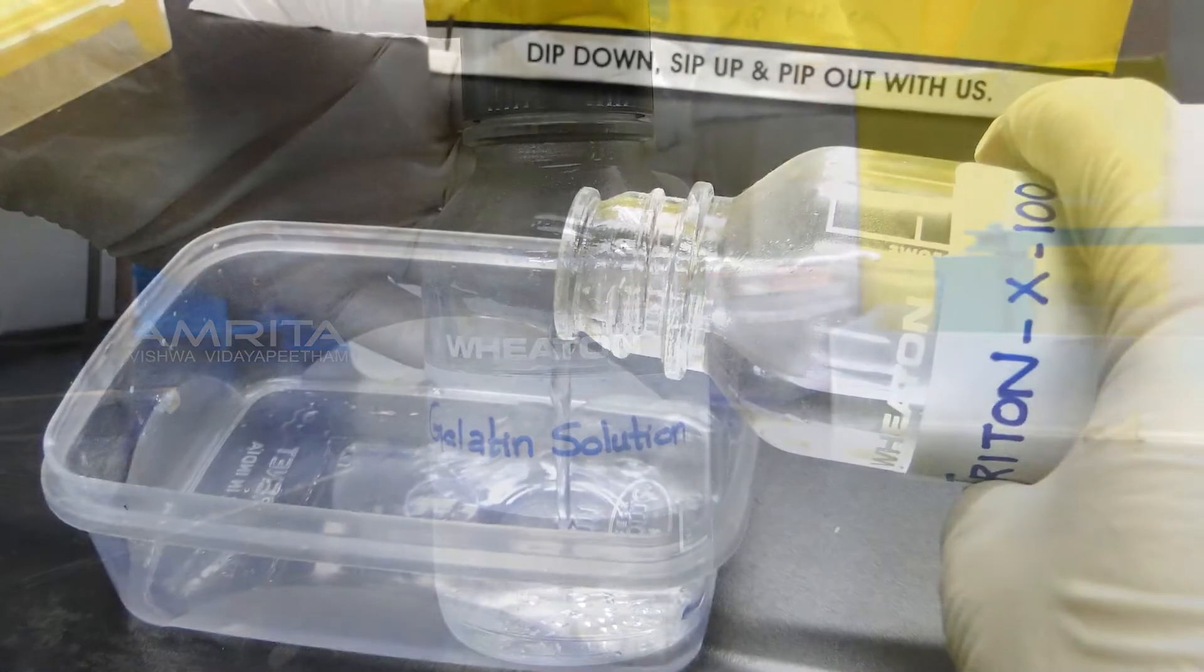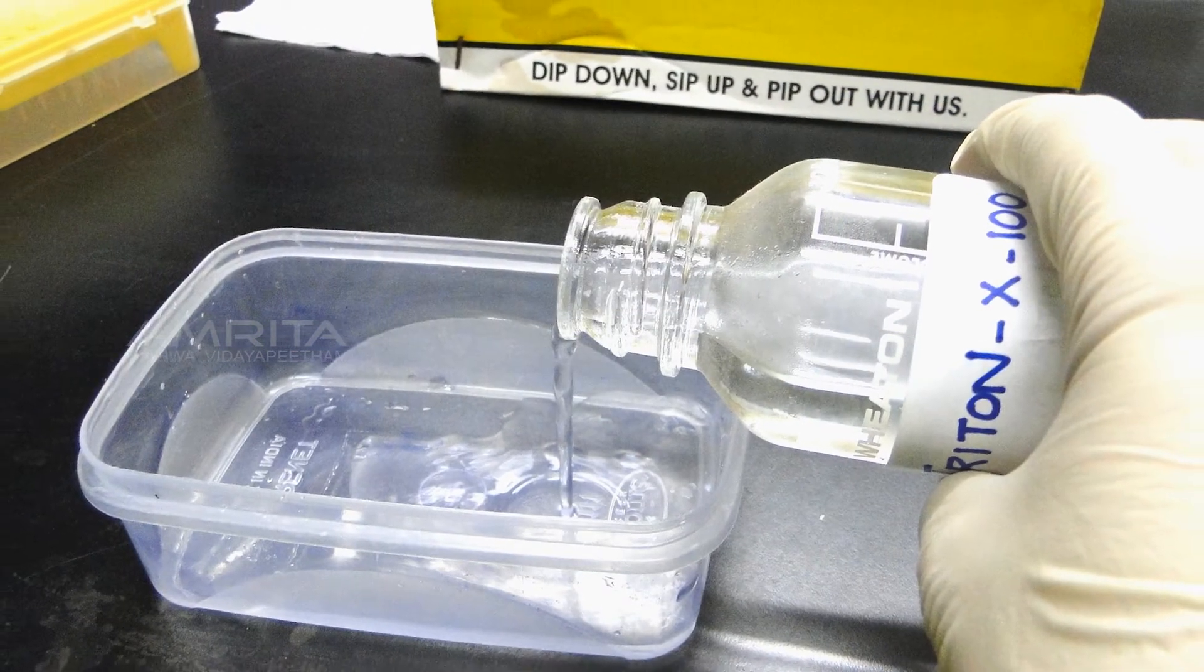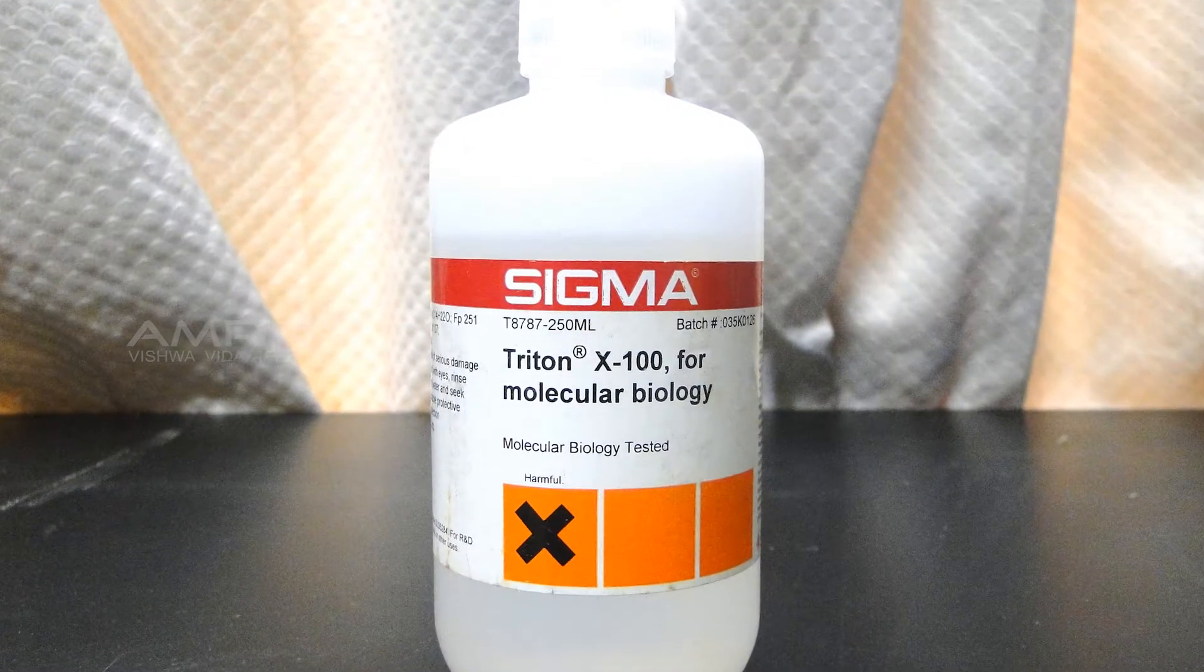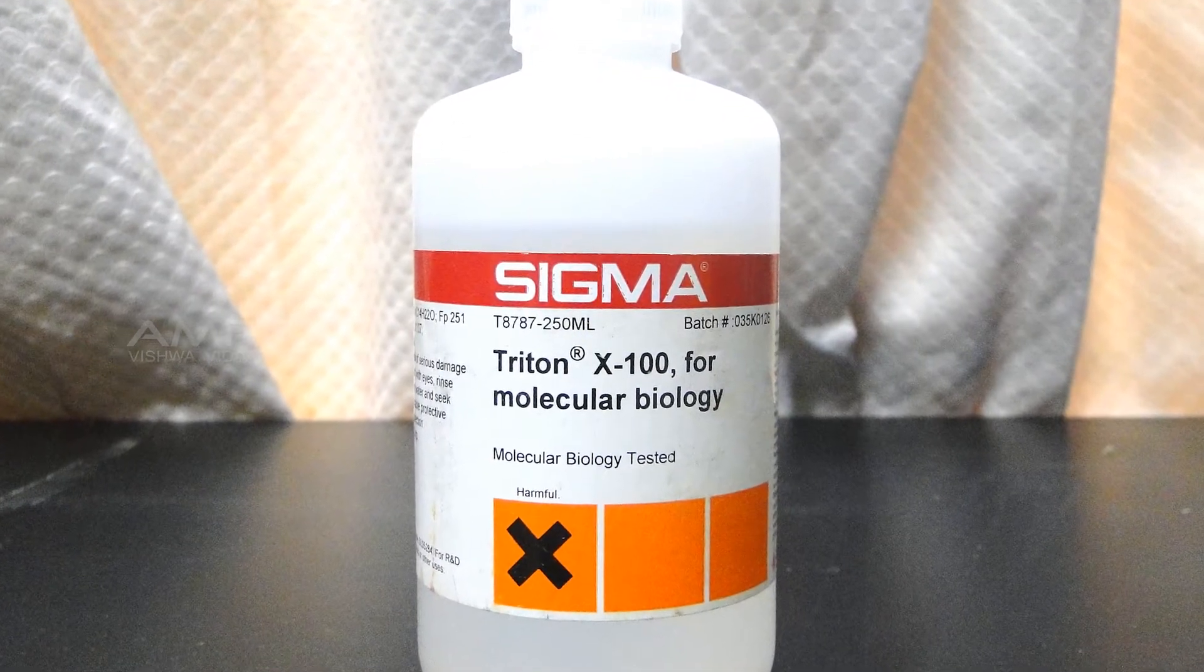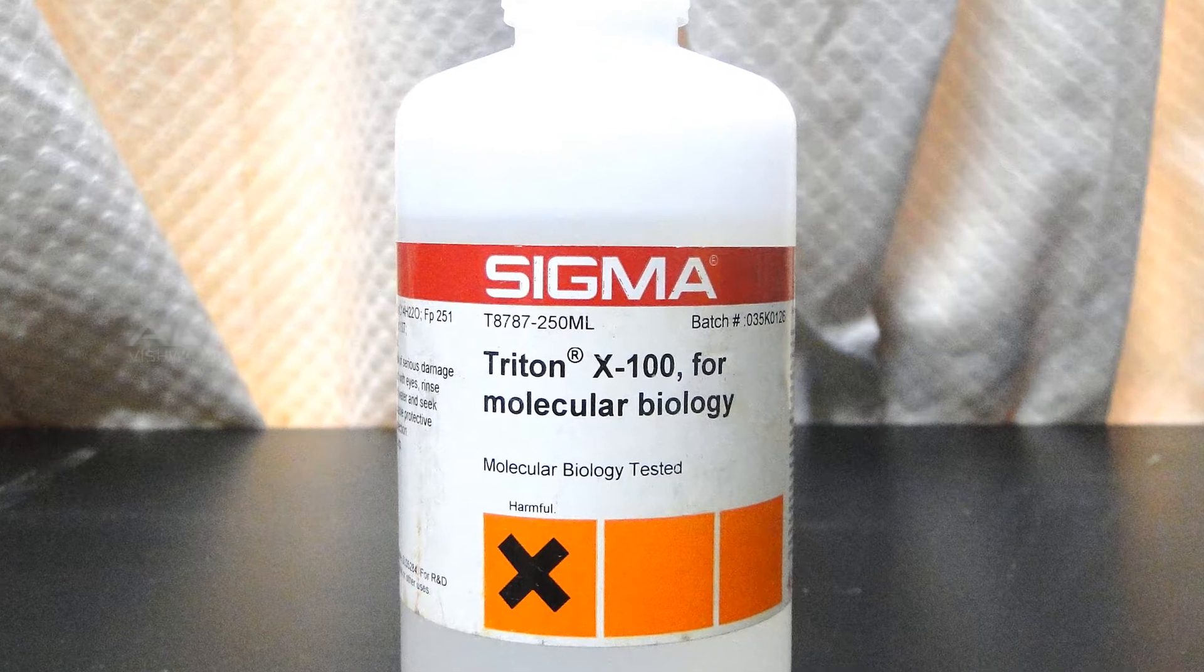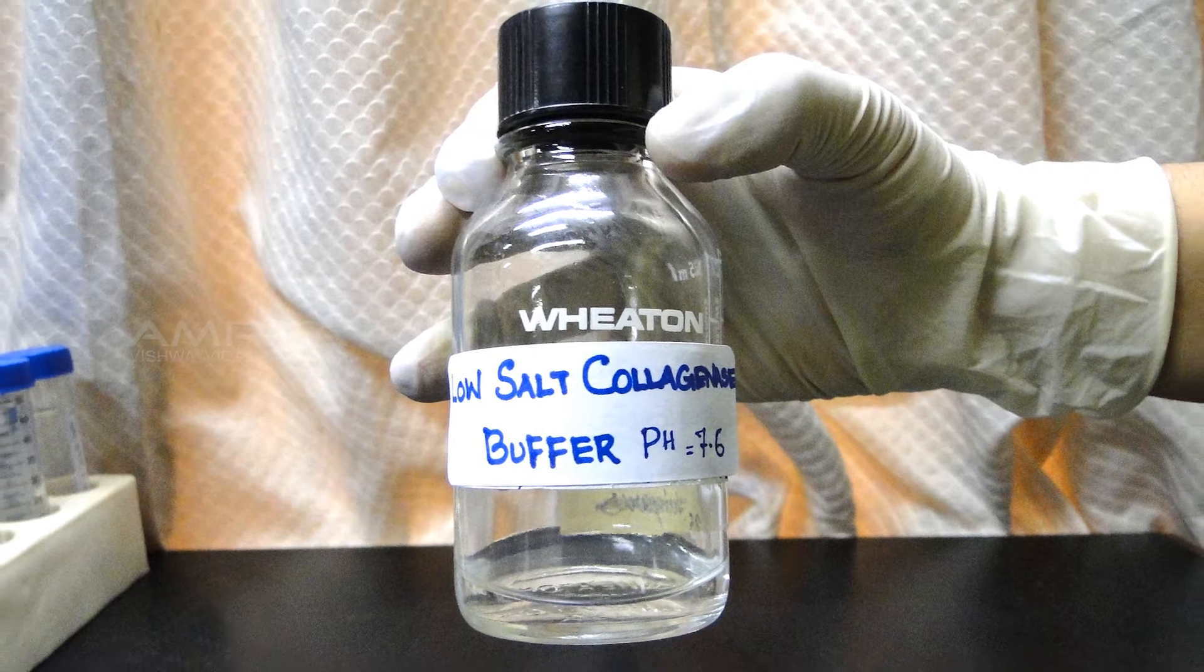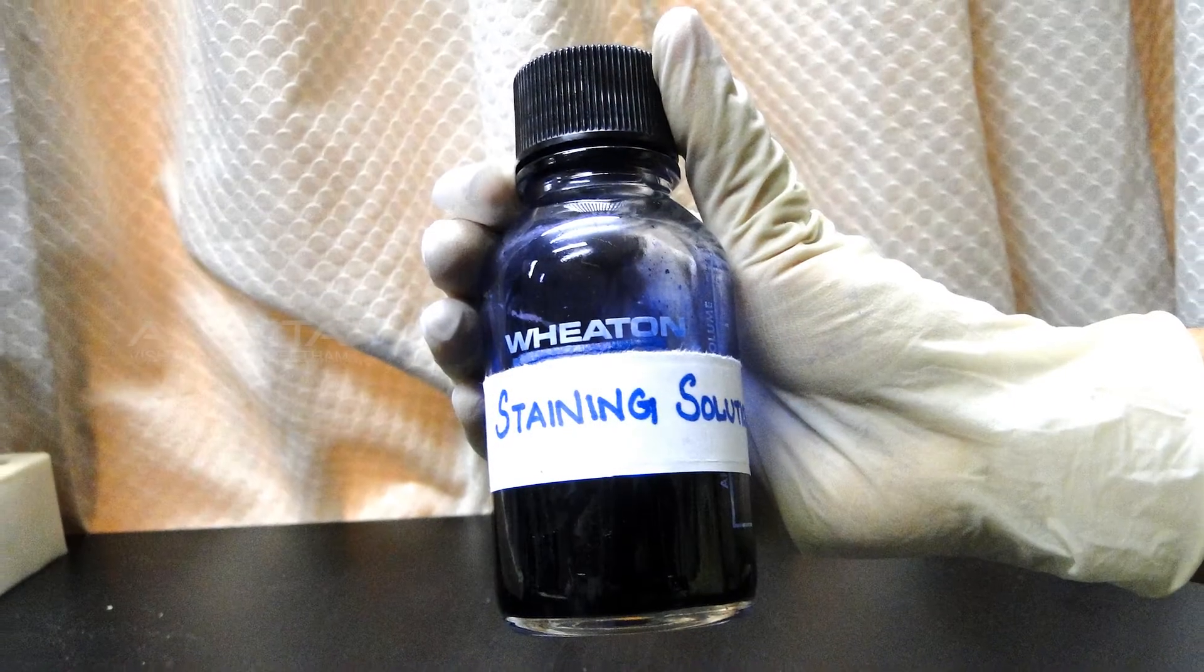After the electrophoretic run, the SDS is removed from the gel, i.e., zymogram, by incubation in Triton X-100, a detergent, followed by incubation in an appropriate buffer for an optimized length of time and temperature. The gelatin hydrolyzed regions are seen as white bands against blue background of the gel when it is stained with Coomassie Brilliant Blue.